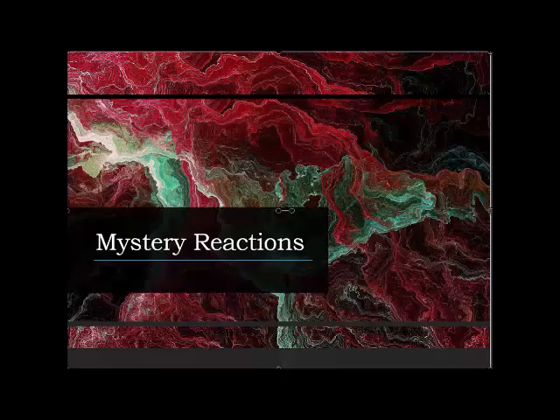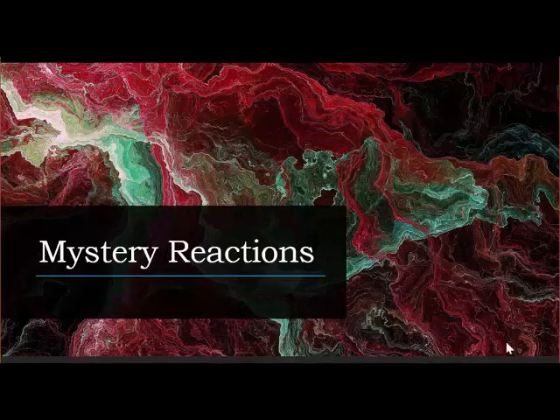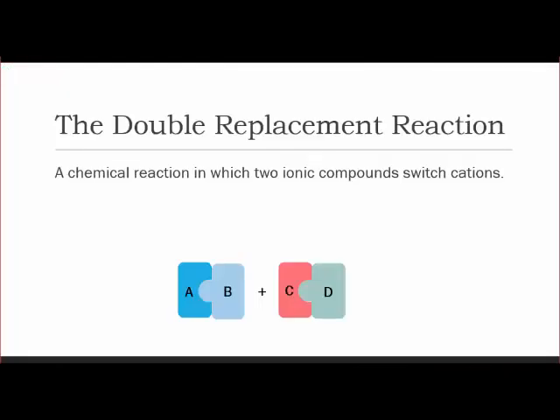Hey Chem class, I just wanted to introduce you to the lab you're going to be doing over the next couple of days, which involves some mystery reactions. All of those reactions are double replacement reactions.